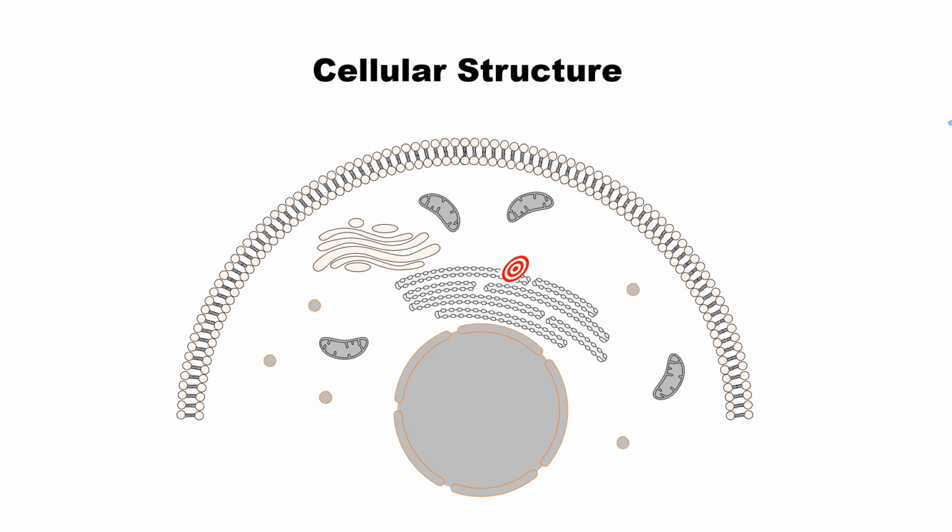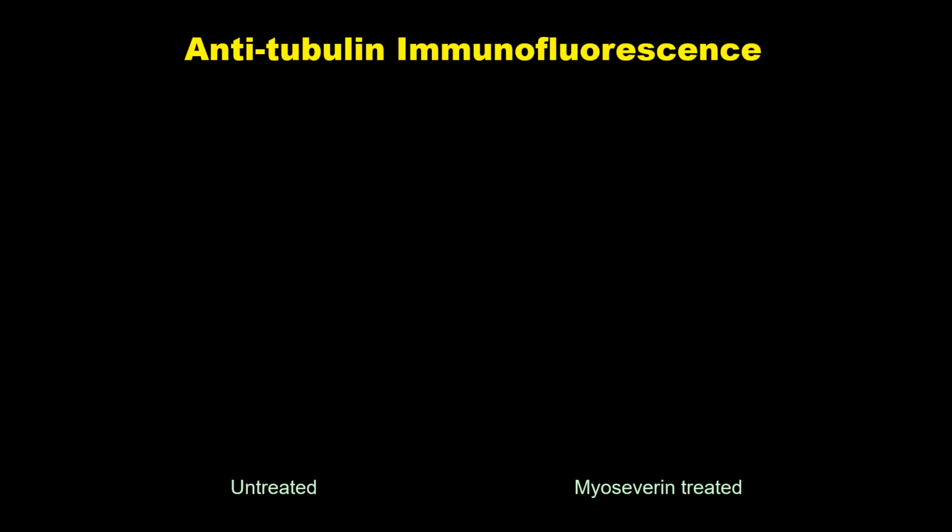In this case, you need to fix the cell first. Here the fixing means chemical treatment utilizing formaldehyde, and then it can connect the amine groups between different proteins and make a cross-linking. That is fixing. Still the membrane is intact. The antibody cannot get in. Now you need to add a detergent and dissolve some part of the membrane structure, and then the antibody can go in and bind to the target. Through this process, the antibody-generated image we call immunofluorescence.